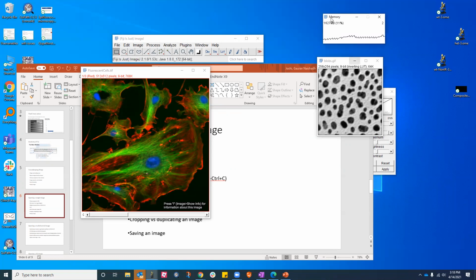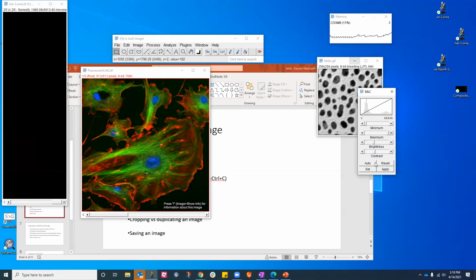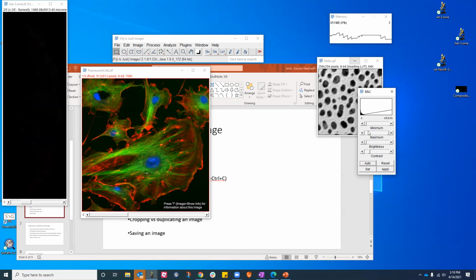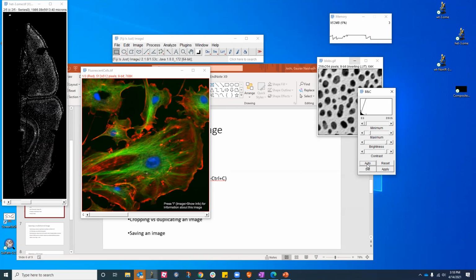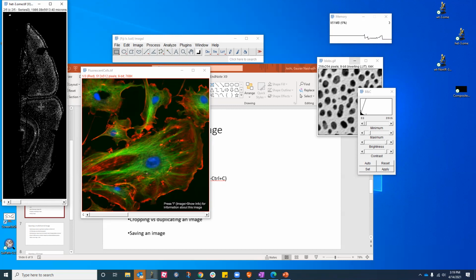And it's not that you need to open the memory all the time. This is for you to understand what's really happening in the background. So I'll crop a tiny bit of the area over here.